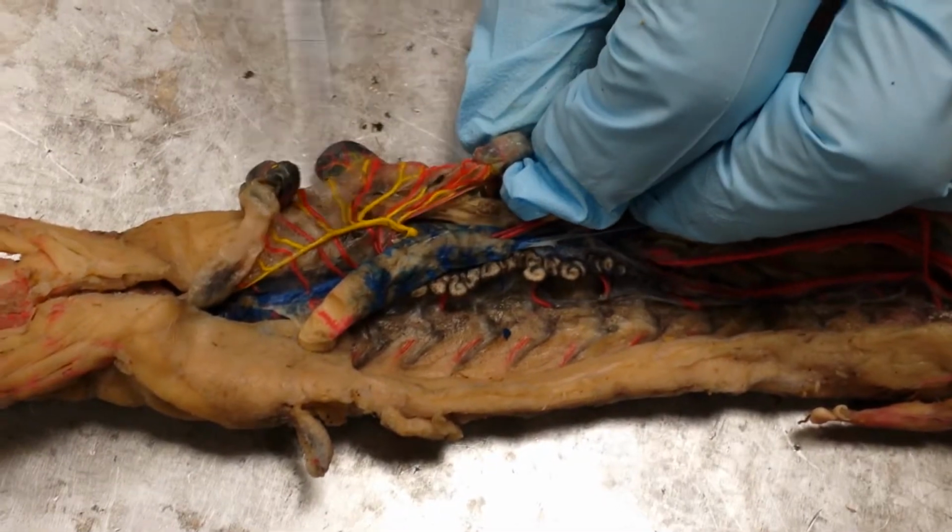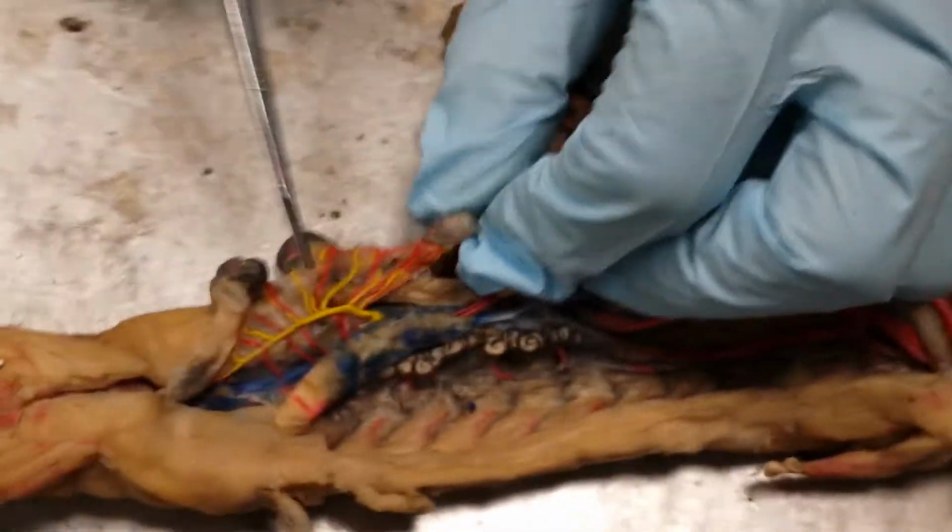Okay, so remember the yellow things are the mesenteric veins. The blue things here are the testicular veins.